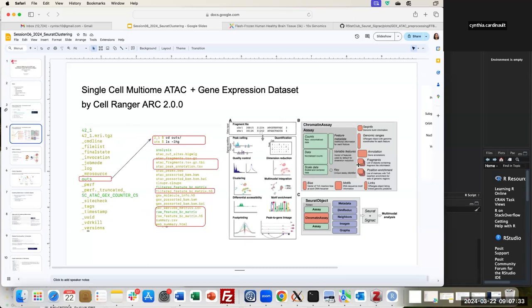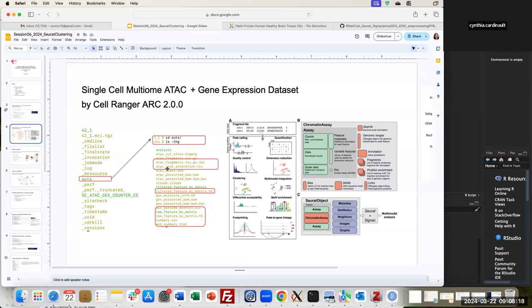Going back to the purpose of these integrated tools: we need to look at how these two modalities in the multiome approach are performing. In the past session, we looked at the raw data being processed. When you run the Cell Ranger ARC pipeline on raw data to generate count matrices, the output directory contains files related to the ATAC data — the fragments TSV and the index — along with peak annotations.